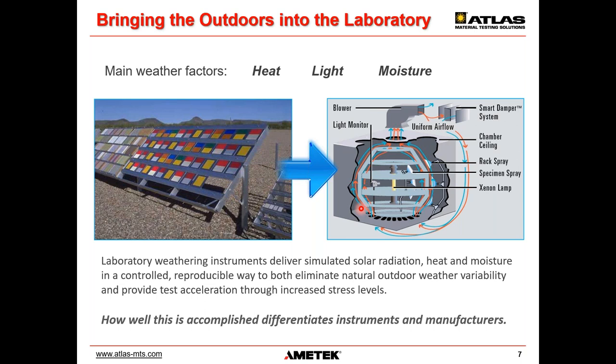Furthermore, the instrument can control each of these factors independently, from a wide range of irradiance levels, humidity levels, and temperature levels. So there are many different types and variations of testing devices, and how well they simulate those stress levels can be a little bit different, and that's really the core of today.